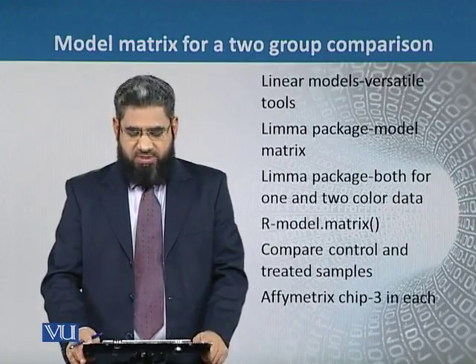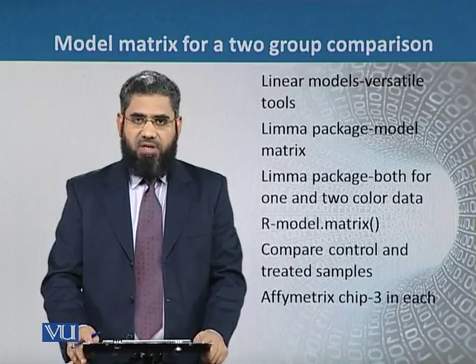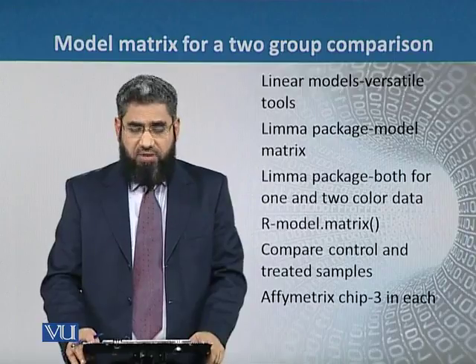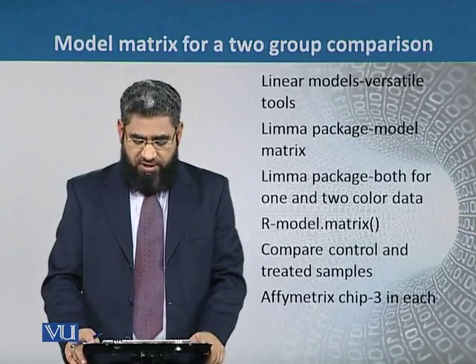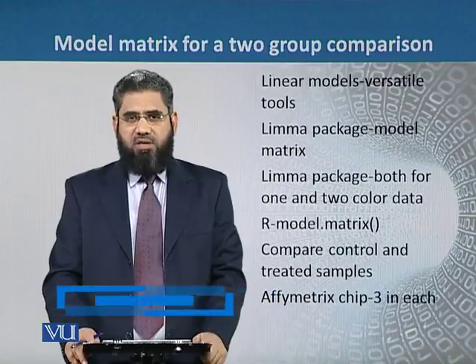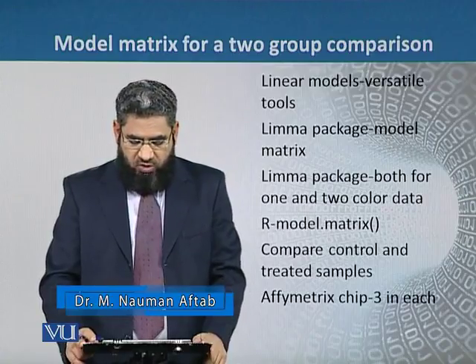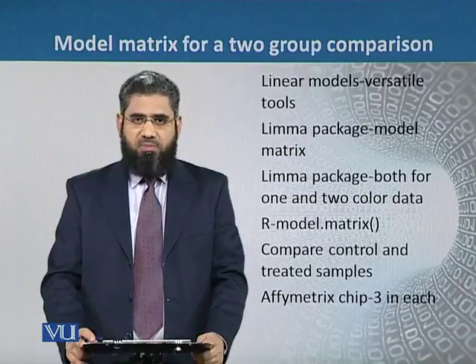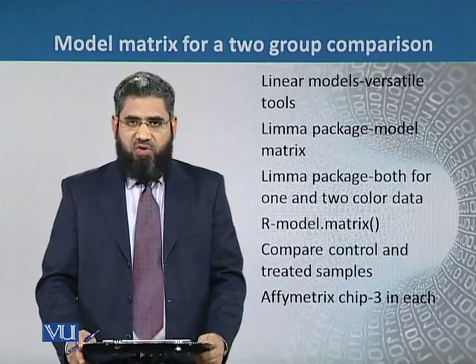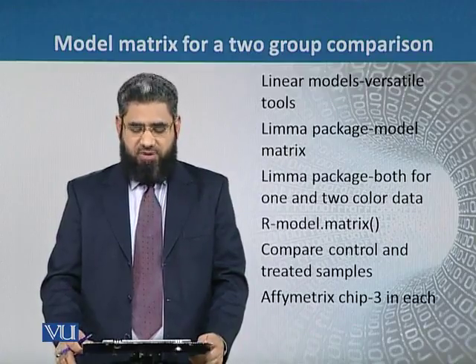Fortunately, the limma package can be used for both one-color and two-color data for Agilent. In R, there is a command known as model.matrix, and by using this command, it is very easy to formulate the model matrix for any experiment. For example, if we want to compare the control experiment with the treated samples, we can do this very easily by using the limma package and by formulating the model matrix.